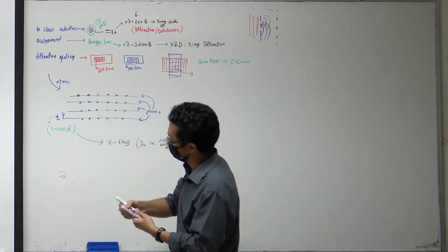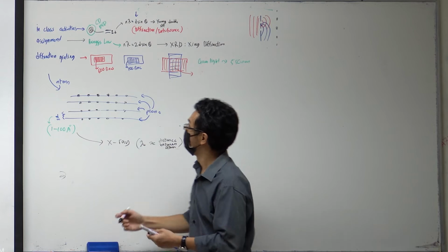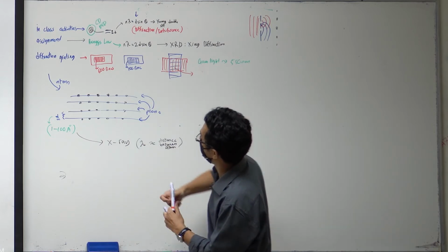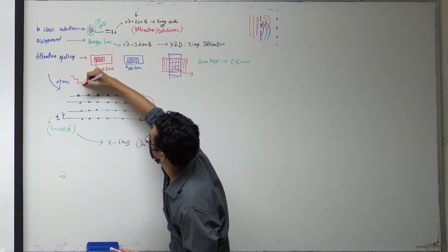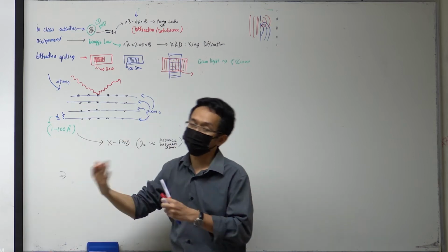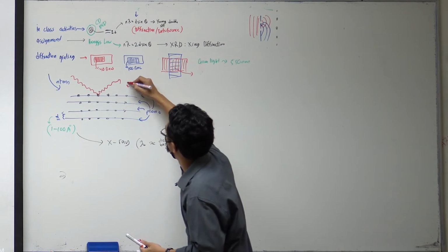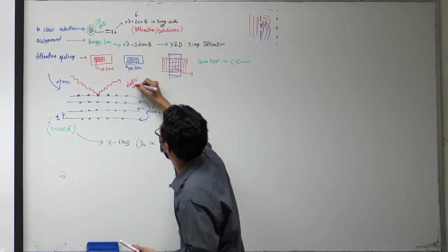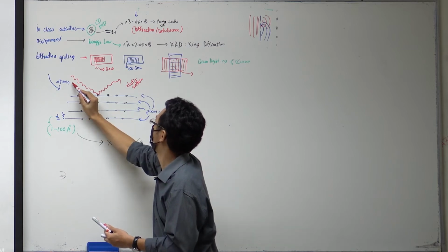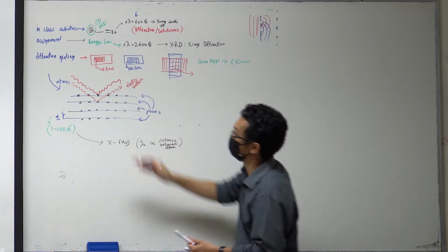But in XRD, the atoms behave more or less like hard balls. When the X-ray comes in, it is reflected and scattered. We call this elastic scattering. The second wave also comes in and scatters the same way, and so on. There are many waves.